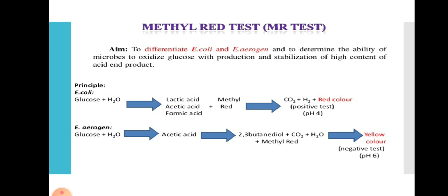The methyl red test is used to differentiate two major groups of facultative anaerobic enteric bacteria: those that produce large amounts of acid and those that produce the neutral product acetoin as end product. Both are performed simultaneously. The MR test is simultaneously performed with the Voges-Proskauer test. Usually, we obtain opposite results for MR and Voges-Proskauer tests.